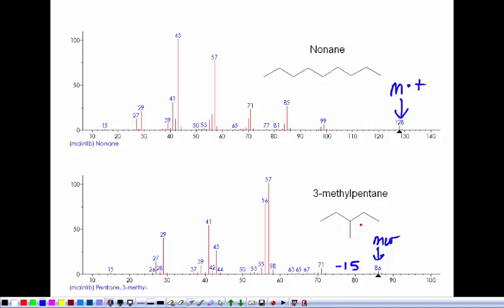We are not going to give mass spec nearly its due here, but if you wanted to, you could figure out the structure of a molecule from its mass spectrum. You can do a pretty good job of that by looking at what fragments were lost and what fragments exist. But we'll talk more about that next week. Here's the key thing, though. The peak that's farthest to the right is the molecular weight. Okay, that's the important part.